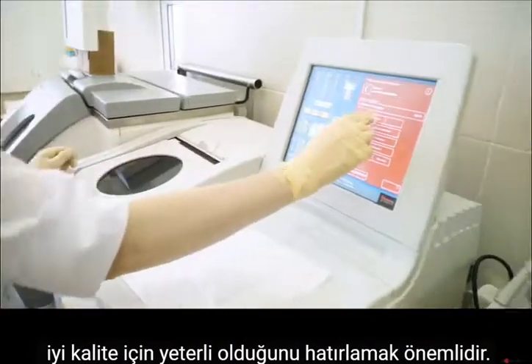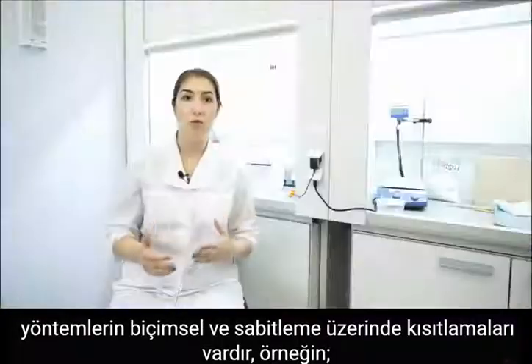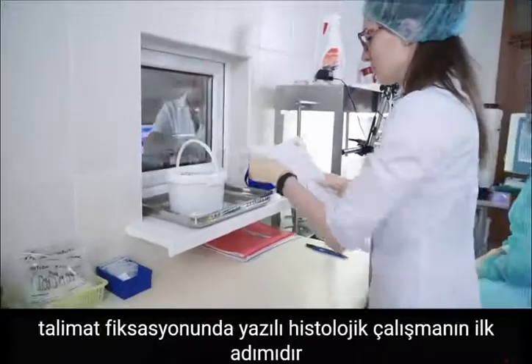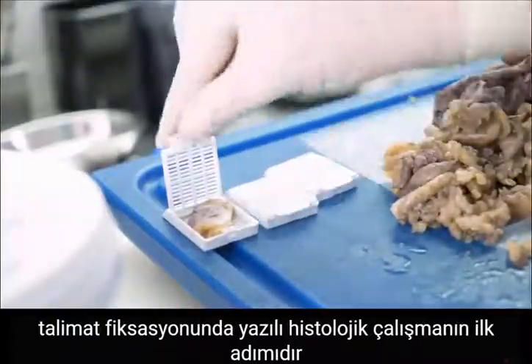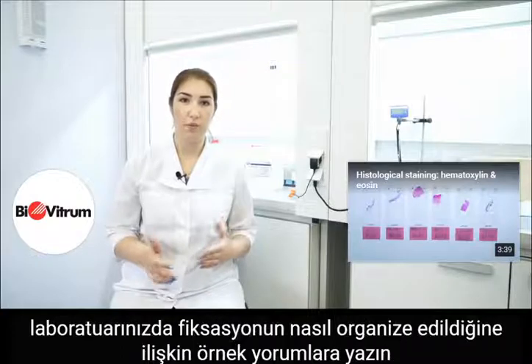It is important to remember that some methods have restrictions on formalin fixation. For example, special stains for lipids can be done only in frozen sections. Always pay attention to what is written in the instruction. Fixation is the first step of the histological study. That's why all the mistakes will lead to the loss of the diagnostic value of the sample.